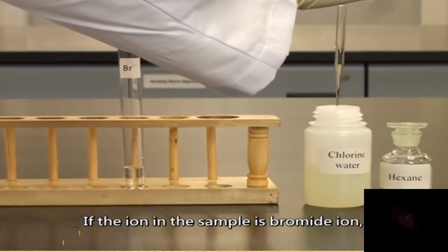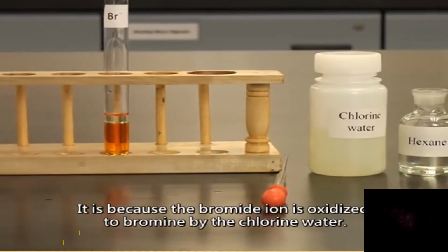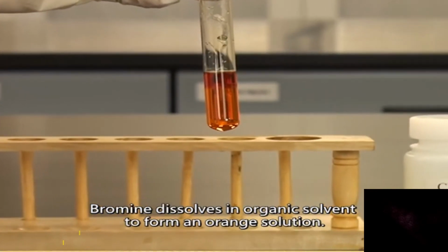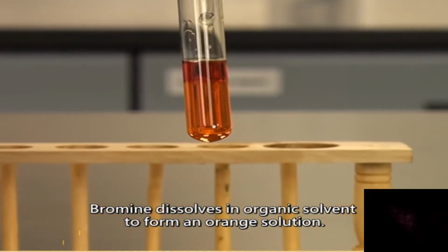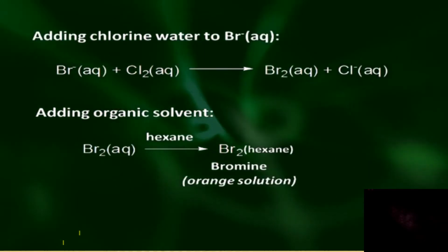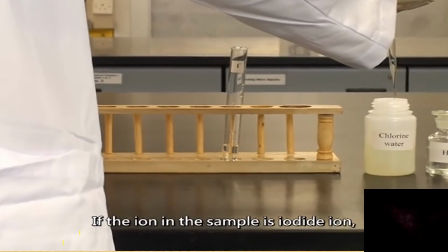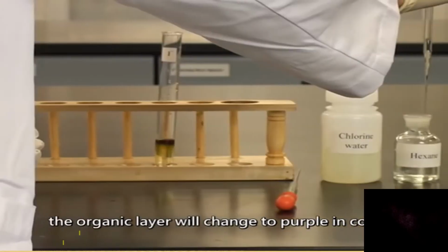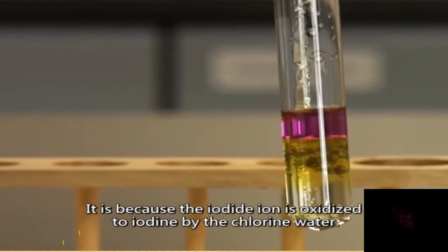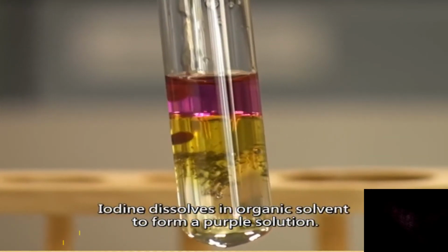If the ion in the sample is bromide ion, the organic layer will change to orange in color. It is because the bromide ion is oxidized to bromine by the chlorine water. Bromine dissolves in organic solvent to form an orange solution. If the ion in the sample is iodide ion, the organic layer will change to purple in color. It is because the iodide ion is oxidized to iodine by chlorine water. Iodine is dissolved in organic solvent to form a purple solution.